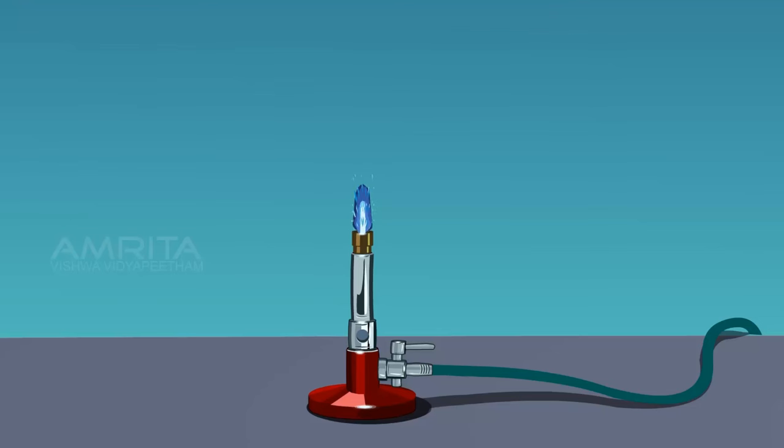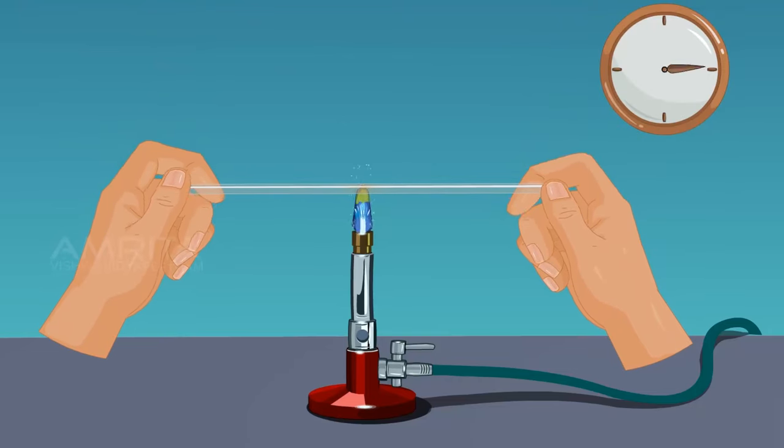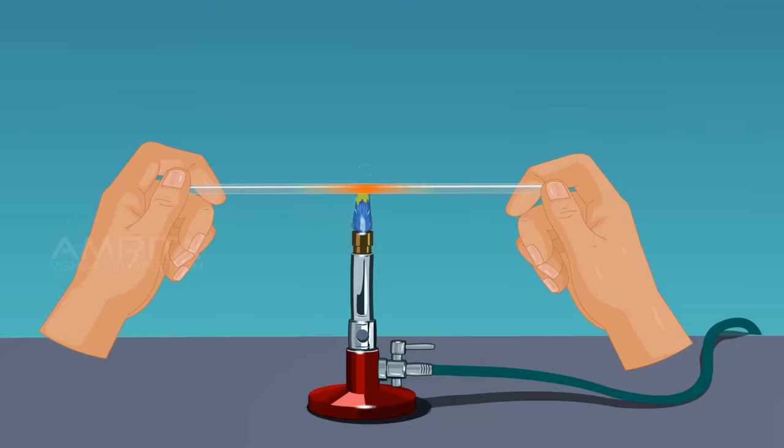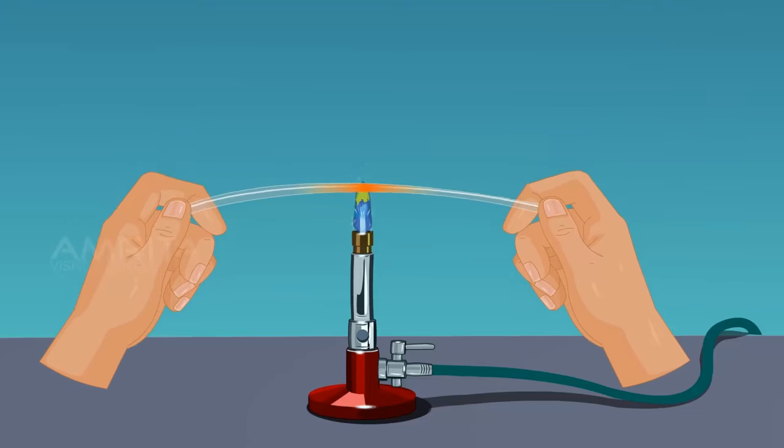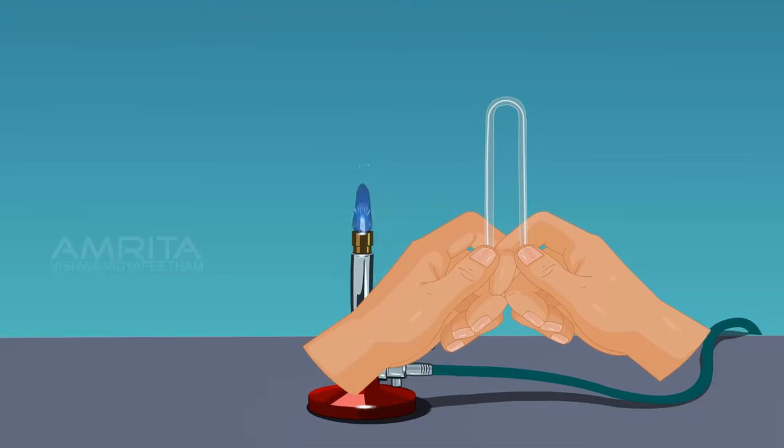Hold the glass tubing between the thumb and the fingers. Introduce it lengthwise into the non-luminous flame of the burner. Keep the tube rotating till it softens. Apply gentle pressure so that it bends by itself. Remove the tubing from the flame.